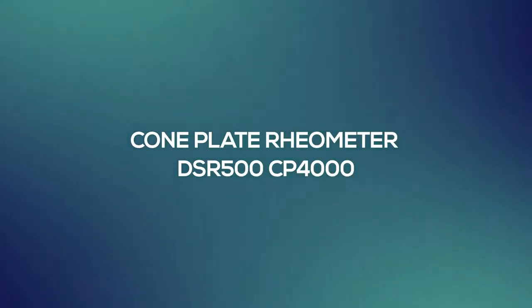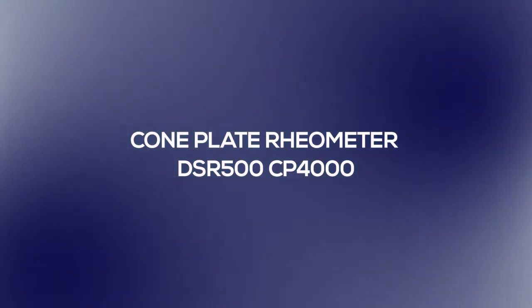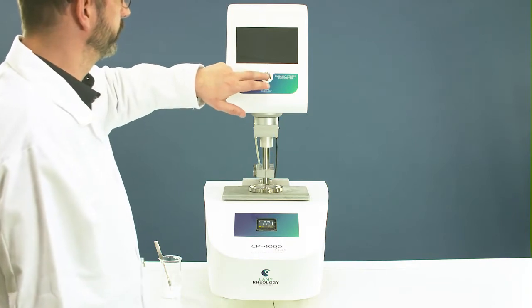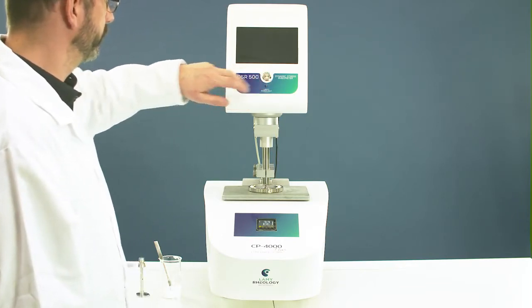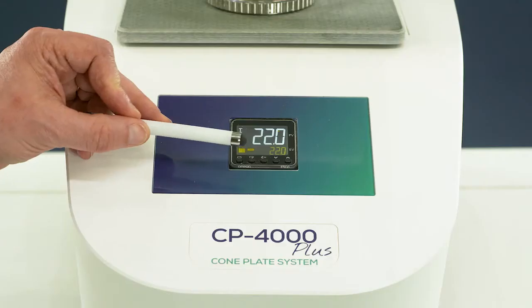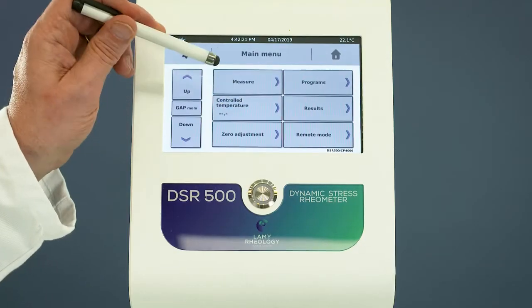The only complete rheometer with automatic lift and curve on display in the world. Switch on the device, check the temperature set point, and change it if you need.